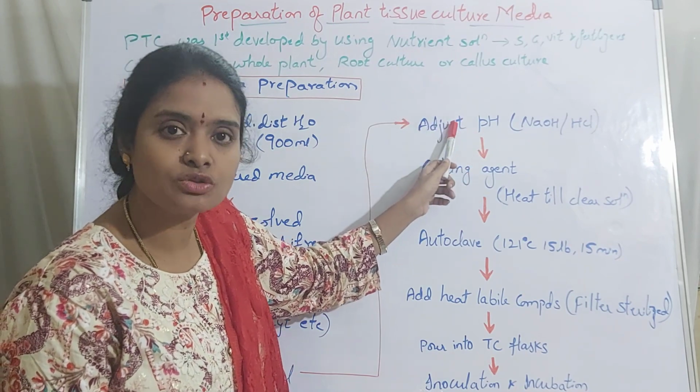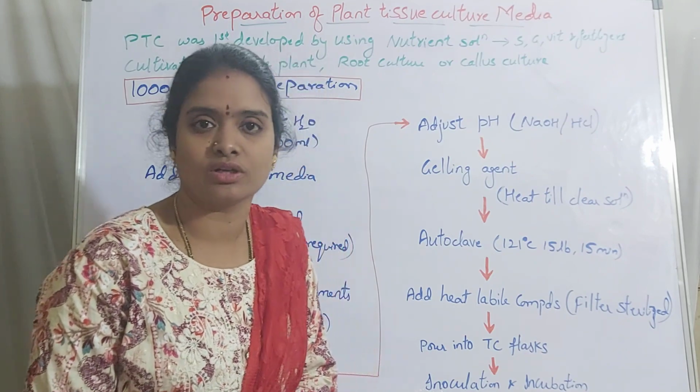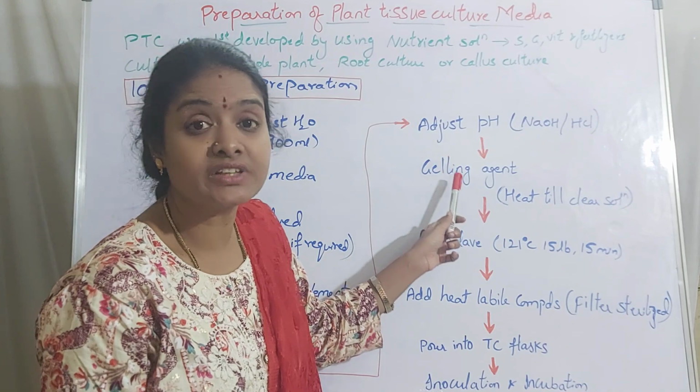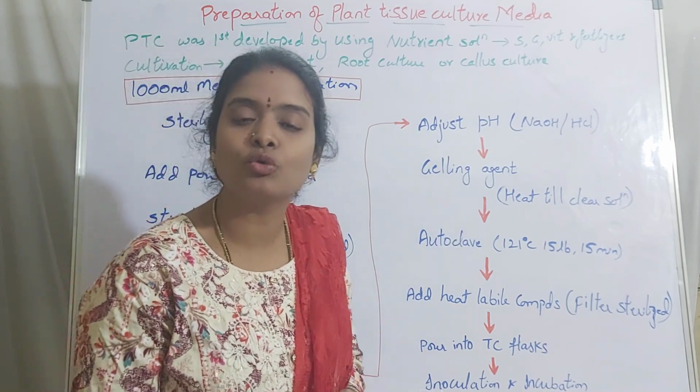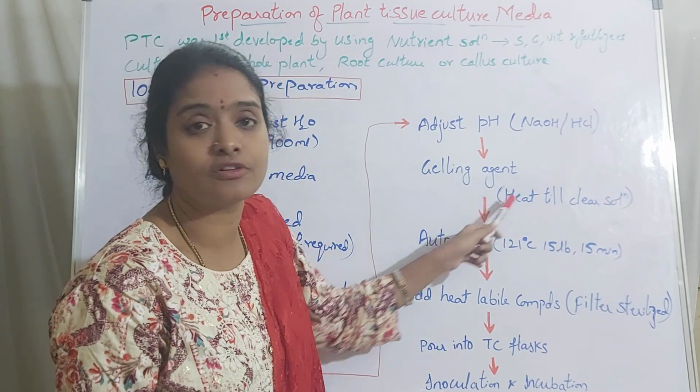To this nutrient solution, if you want to prepare a solid or semi-solid media, you add the gelling agent. If it is a liquid media or you want to go for a suspension culture, you can avoid the addition of the gelling agent.